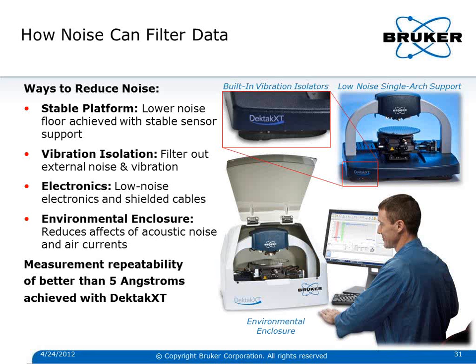And again, that's the main thing you want from a stylus profiler: measurement repeatability. You take all these efforts to standardize your filtering and to use the same type of ISO or ASME filtering for your measurements, but if your stylus profiler is getting different measurements from one day to the next because of variability in noise or vibration or the measurement itself, then you're not going to be able to standardize your measurement. It doesn't really matter which standards you pick if you don't have a repeatable measurement tool. So it's really important that you select a measurement tool that's going to work best for your particular application.